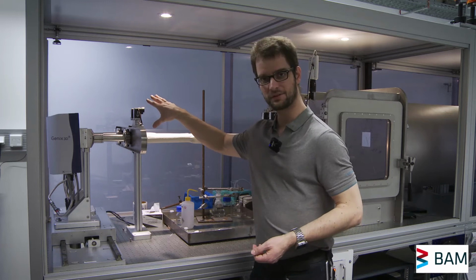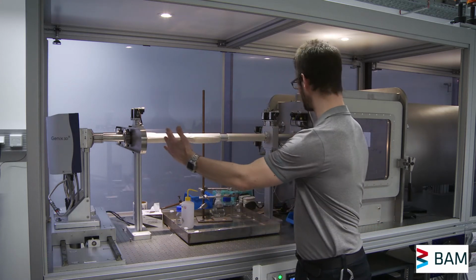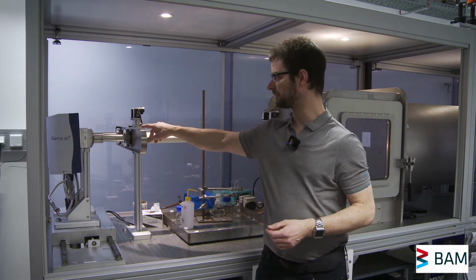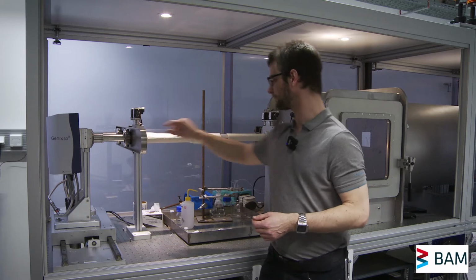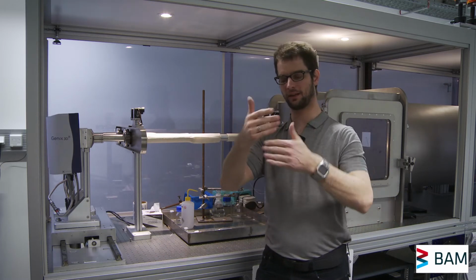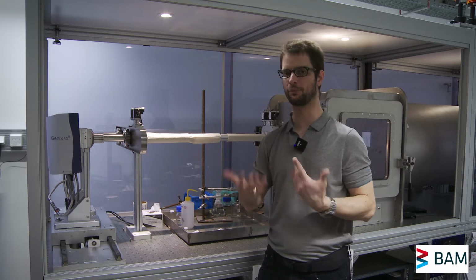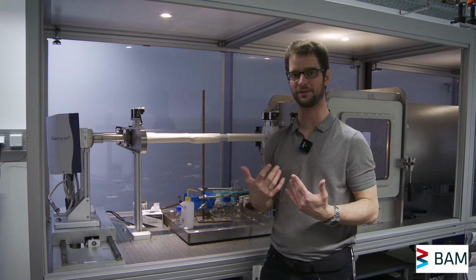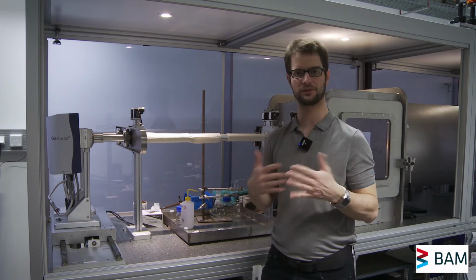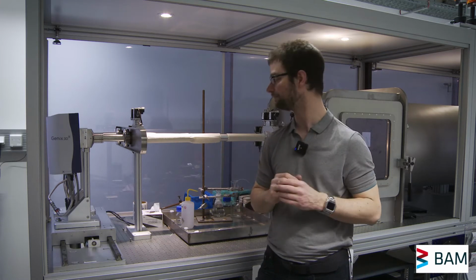Right behind the sources is the collimation section. In our case, this is relatively short, about a meter, 1.2 meters. This has three sets of slit blades, one here, and one here. And with this, we can chop down the beam to a nice size of between 0.2 and 0.5 millimeters. We don't really use any of the larger sizes beyond 0.5 millimeters here. We want to keep our beam nice and tiny.